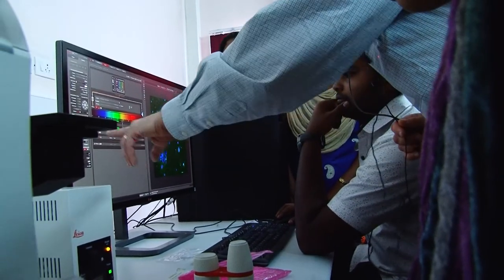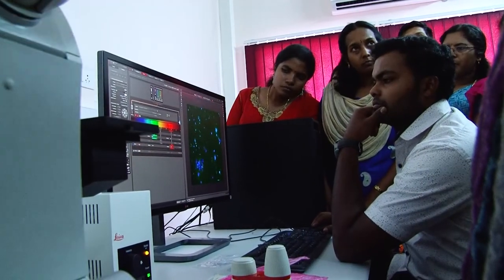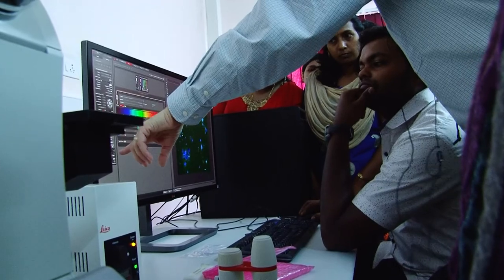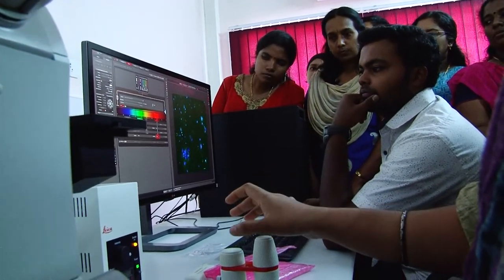It's 27. That's good. So basically what it says is our Z size is 17 microns. So we're gonna go 17 microns, and we're gonna take 27 steps, so about every half micron, right? Okay, try it, let's run it. Let's see what we get.